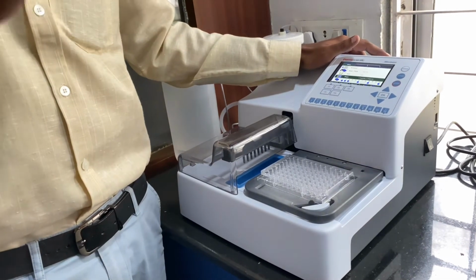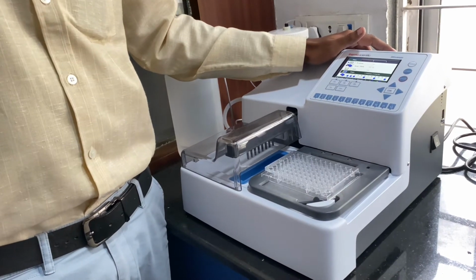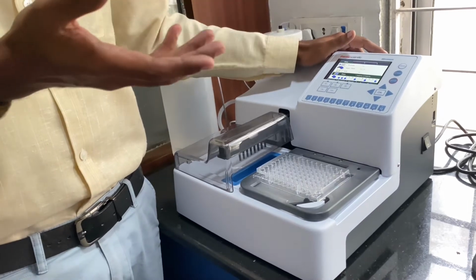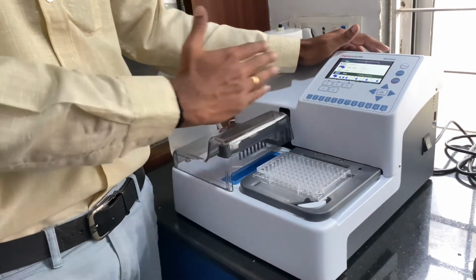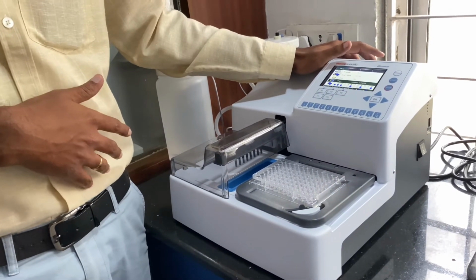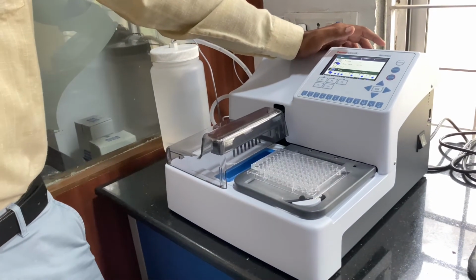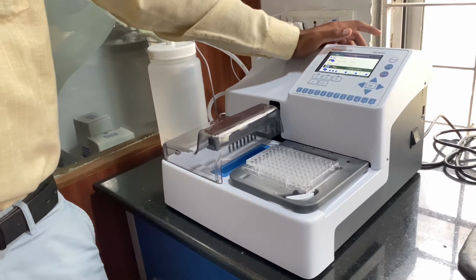But if you are having more steps, then it may be 10 minutes. In some protocols, you have to incubate for half an hour, then wait for half an hour and then do the wash. So the time depends on the protocol. Normally for 96 well, just dispense and aspirate, we have completed in less than 1 minute. Even there, just for reading it takes hardly 5-6 seconds. You will take video and give.